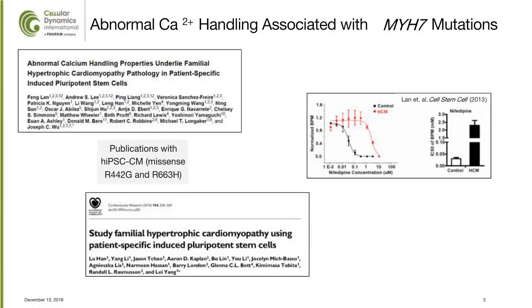However, with the HCM cells, this concentration response curve is shifted to the right, suggesting that these cells are less sensitive, that it takes more nifedipine to really stop the beating. This is consistent with the myofilament calcium sensitization hypothesis for HCM. We looked at this with the R403Q cells, and we saw the same response.